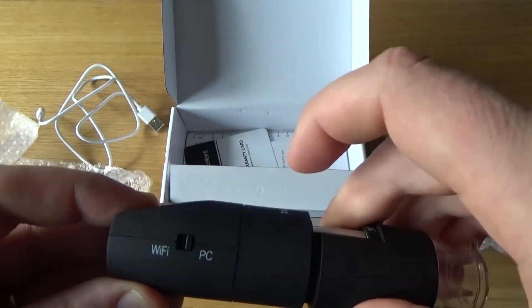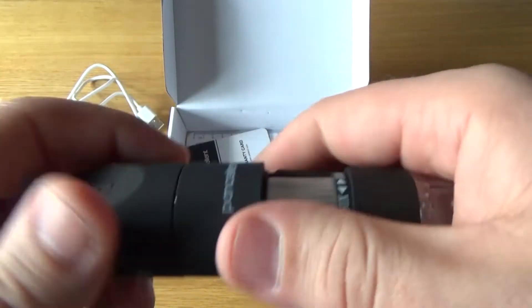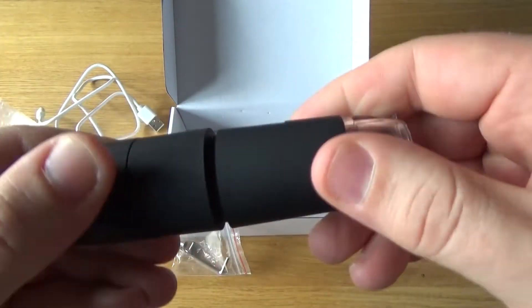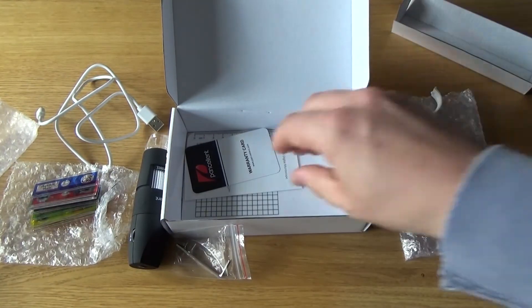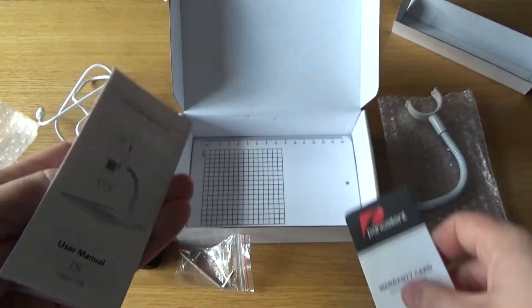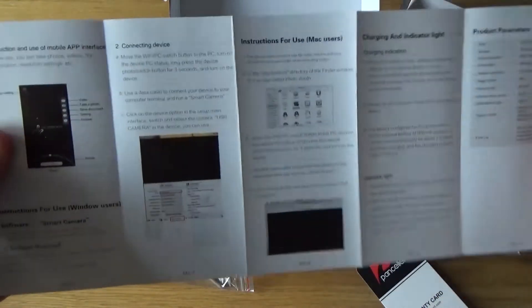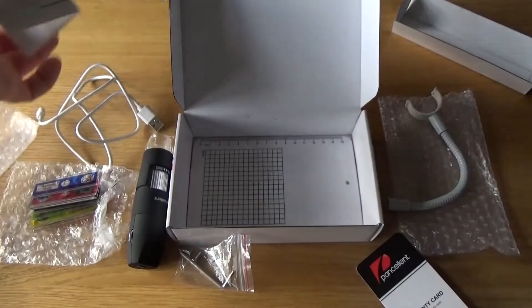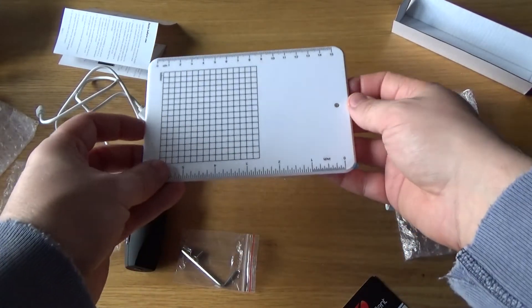There's a button on the back which switches between Wi-Fi functionality and PC or Mac connected functionality. Overall, it feels fairly weighty and high quality. It doesn't feel flimsy when you hold it, and if you carry it on a hike in a backpack it's not going to break very easily. If you keep the lid on the front, your lens isn't going to scratch. It really seems to be made for outdoors hiking and taking it with you.